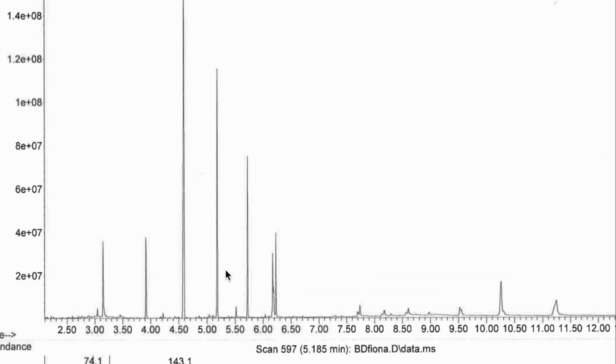Here we see a GC sample where there is some contamination with some larger masses that are coming out after 7-minute retention time. So probably some other residue from coconut oil itself, some partial hydrolysis, partial transesterification, of the coconut oil. Some diglycerides and monoglycerides are probably present in this sample over here.